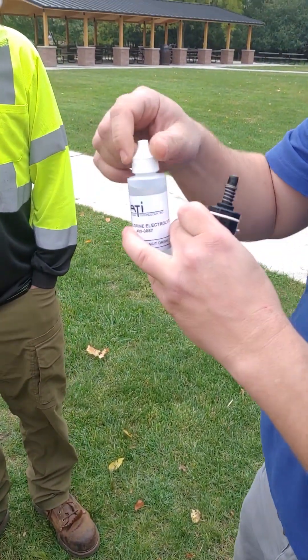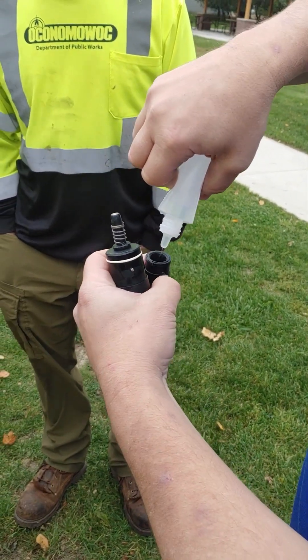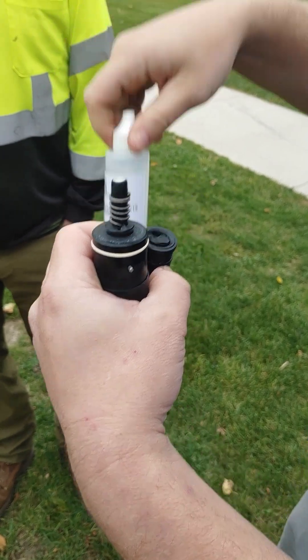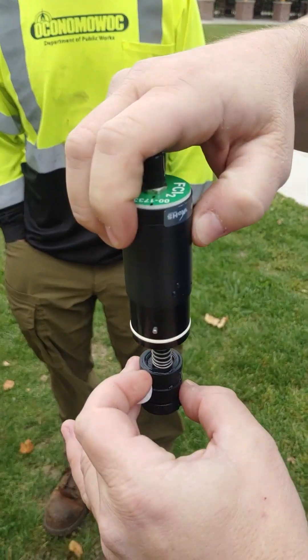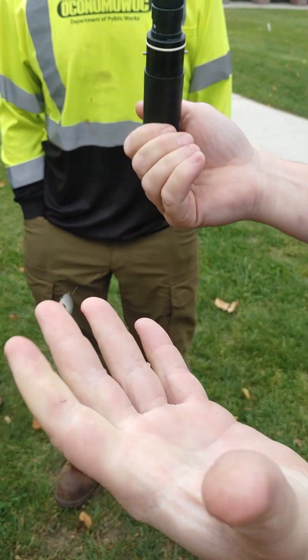I take the electrolyte. You guys are free chlorine, right? So I'm going to fill up the electrolyte to the bottom of the threads. Then I take the sensor and just stick it down into it. The electrolyte's totally harmless, not going to hurt you or anything. Then I just hand tighten that. So that's your maintenance — pretty harmless.